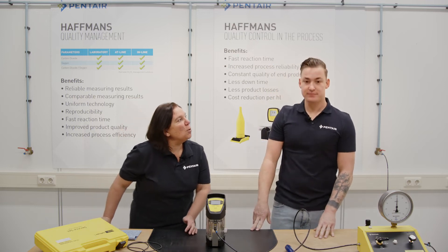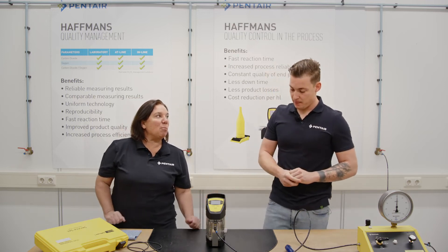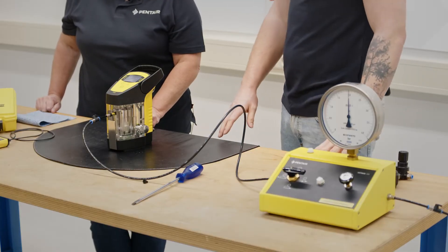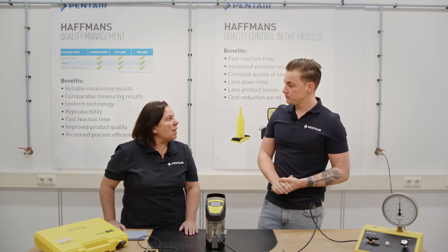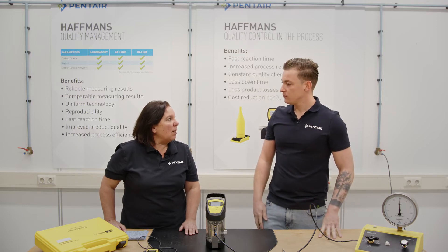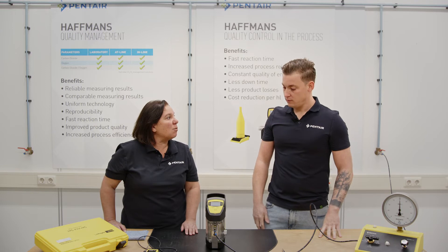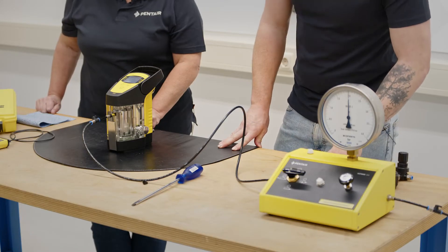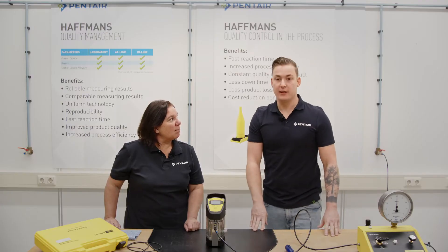But what can we do when we have doubts on the calibration? First of all, the temperature sensor cannot be recalibrated, so when that is out of range we have to replace and repair the instrument. And the pressure? The pressure sensor can be calibrated.